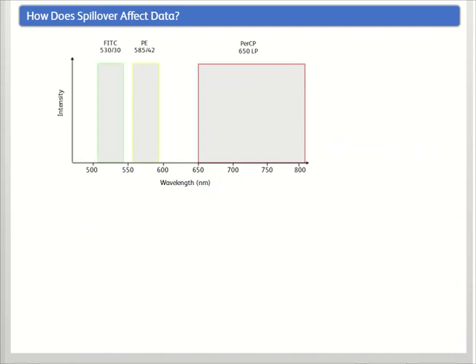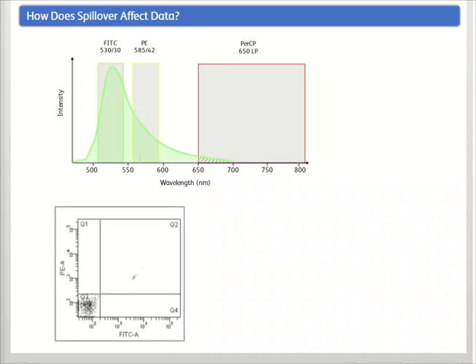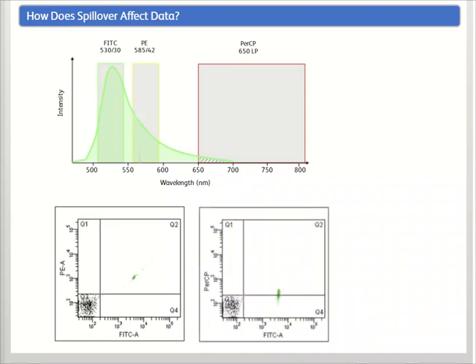More than one fluorochrome can be used simultaneously to identify cells in a sample tube. In this example, each fluorochrome shown is excited by a 488 nanometer laser. Notice that the emission spectra of the fluorochromes overlap each other and bleed into the detection filters for other fluorochromes. This phenomenon is known as spectral overlap.